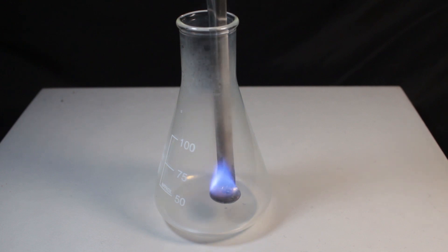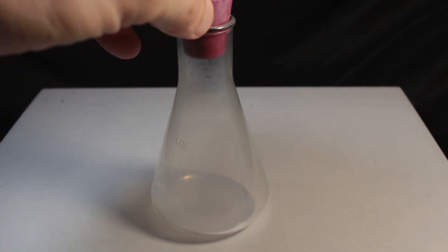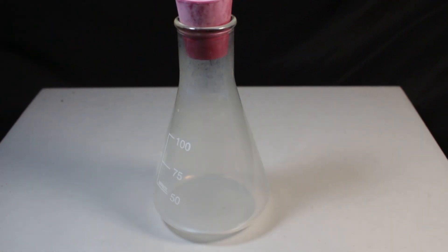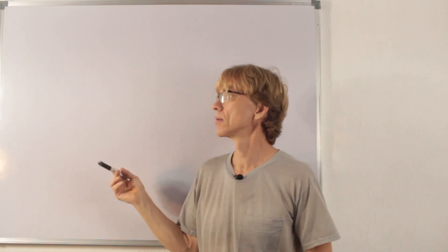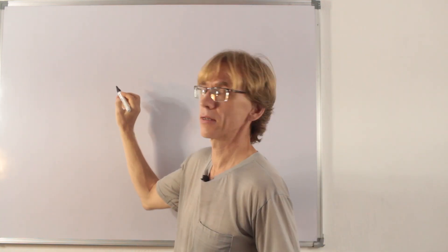We observe here clear textbook description. Sulfur burns in oxygen with bright blue flame. Sulfur burns, forming sulfur dioxide, and that's the equation.